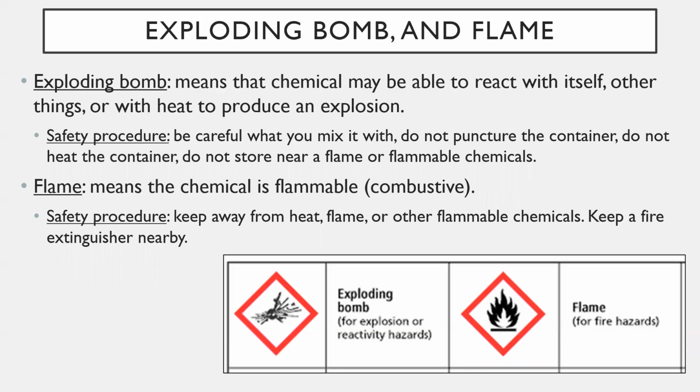Anyway, the first WHMIS symbol is the exploding bomb, right? So, pretty clear symbol right here. It's something exploding. Clearly, that just means it's an explosion hazard, right?